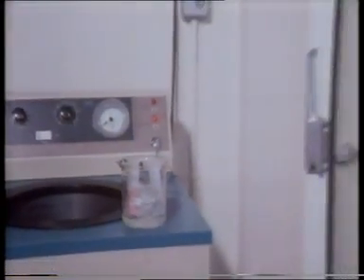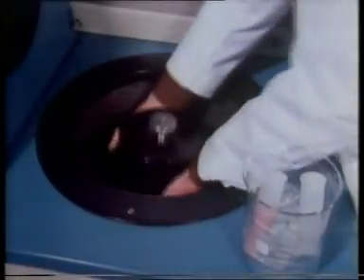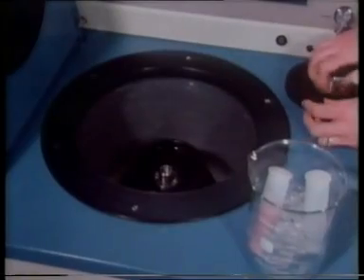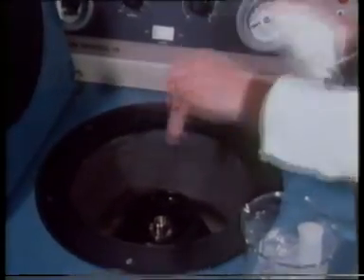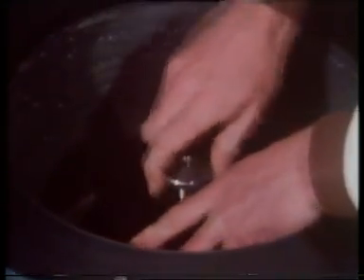The homogenate is now taken to the ultracentrifuge. The rotor of the machine has been kept in a cold room, and the interior of the centrifuge is kept at about two degrees centigrade throughout. The tube containing the liver homogenate is exactly balanced by another tube filled with water, and we switch on.